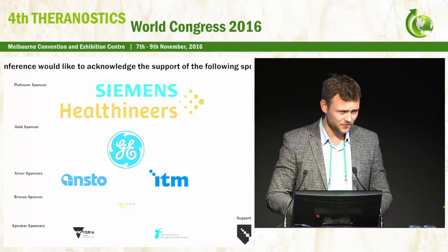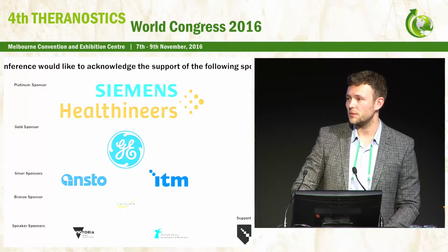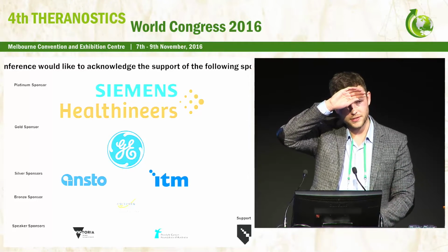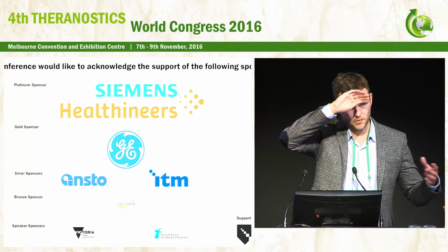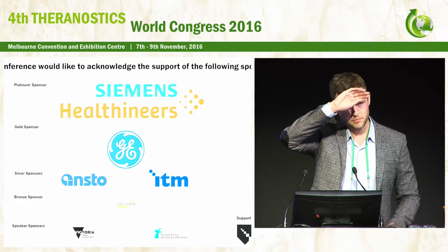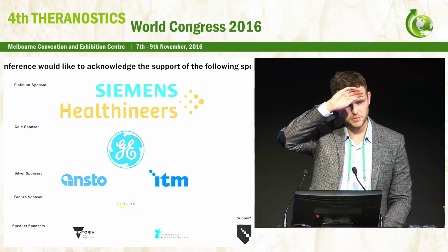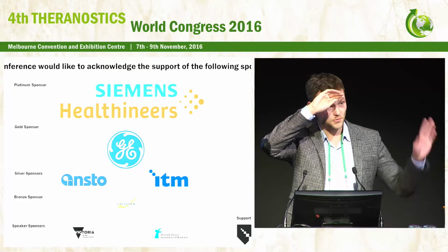Yeah, thank you. Of course, we have validated this method, and normally there is good recovery. When we checked the various activity, it remained on the column, not on the loop, not in the injector. Only in these model preparation cases, we think about some gallium species that can be sorbed in the matrix of the column, because we changed different columns and used different validated methods, recommended by the Pharmacopoeia, and everything. But this situation was repeated, not only in our labs, but in other labs. Yeah, but it cannot just disappear. You have to find it somewhere. Yeah, it always remains in the column.